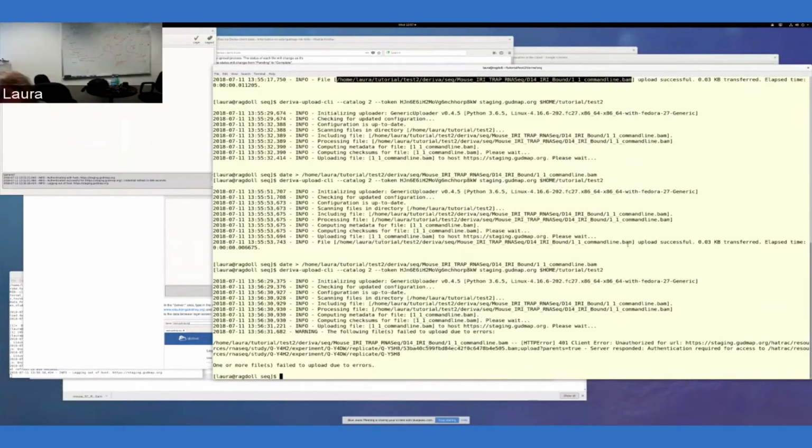Right. If you try to do that, then one of the first things that the client tries to do is determine where in the database this file needs to be attached. So if the records don't exist in the database, you'll get an error like one of the ones that we saw for those two that failed in the GUI tool.